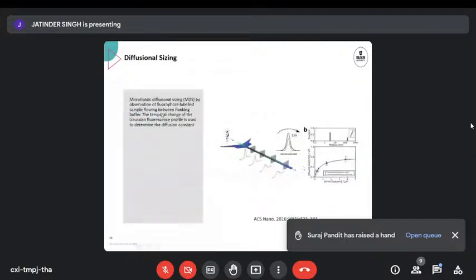which is something that's done here, where they look at sizing the radius of different proteins using a microfluidic device, using a microscope to actually study how wide the zone gets by using a confocal scan throughout the channel. The rate at which this peak here gets wider is directly linked to its diffusion constant. The diffusion constant, through the equation that just got scrambled up on my slide, is directly linked to its hydrodynamic radius. So we can determine experimentally the diffusion constant from how long it takes to go from a relatively sharp zone when it's injected into a microchannel to diffuse out into a broad zone.